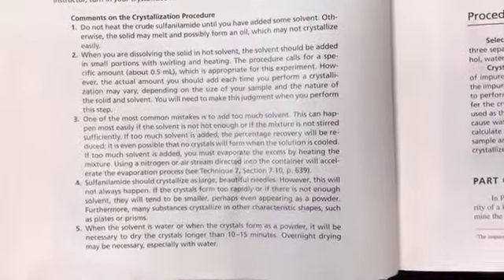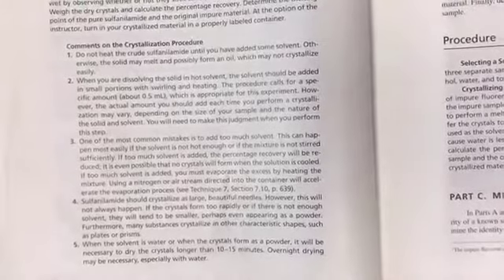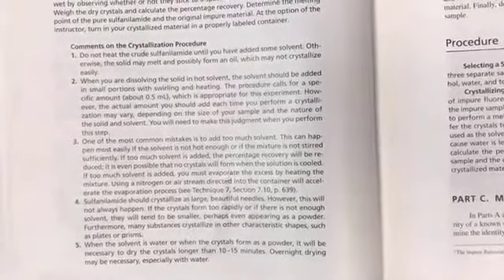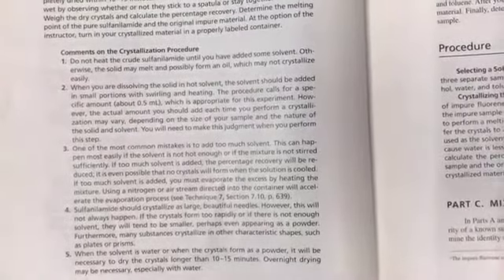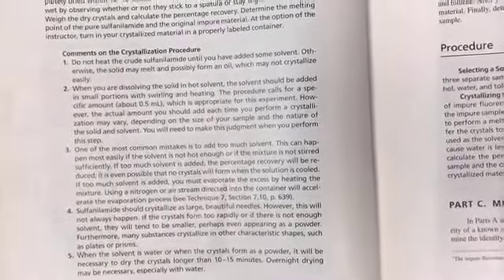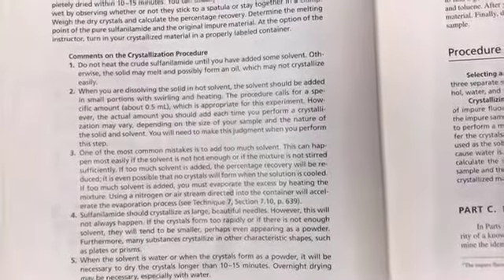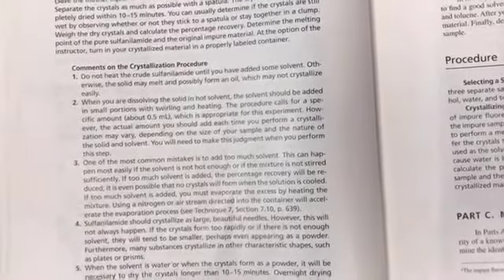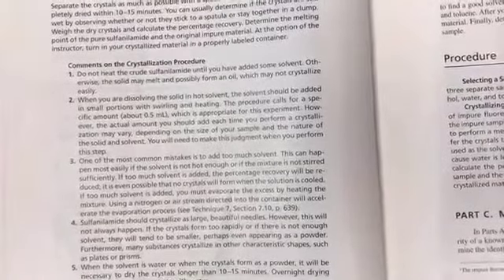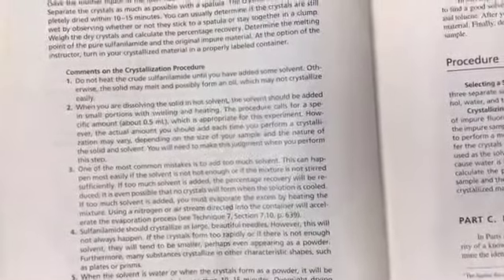If the solvent is water, let's say, in this case the solvent is 95% ethanol, so the boiling point is 78. But if the crystallization solvent is water, right? You need to dry the crystals for a good amount of time. Sometimes we might have to leave the crystals overnight in order to remove all the water before checking the mass of the recrystallized product or the melting point.